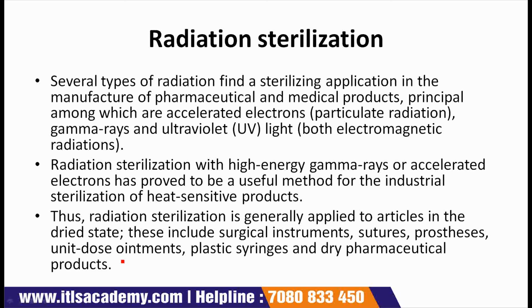Another type of sterilization process is radiation sterilization. First point is, several types of radiation find a sterilizing application in the manufacture of pharmaceutical and medical products.